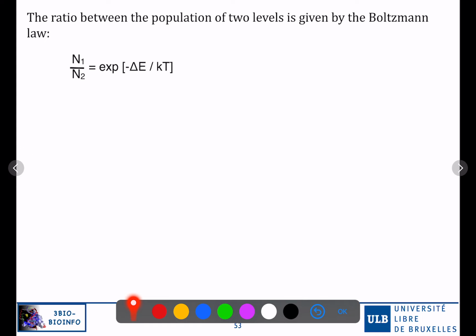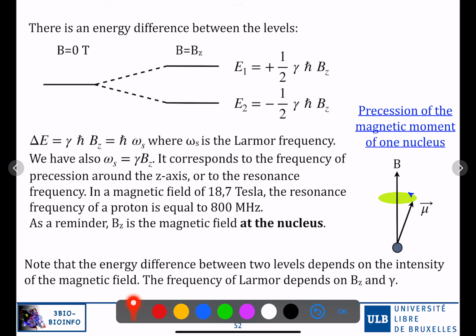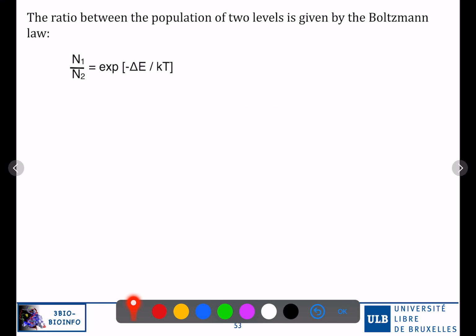And keep in mind that we have just seen in the previous slide that this energy difference is dependent on the intensity of the external magnetic field.